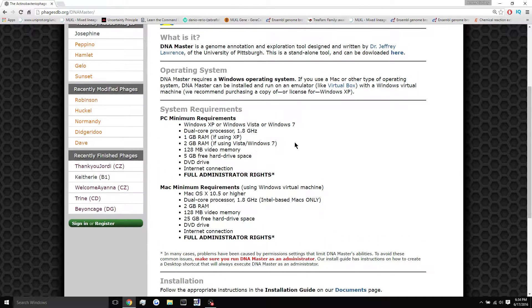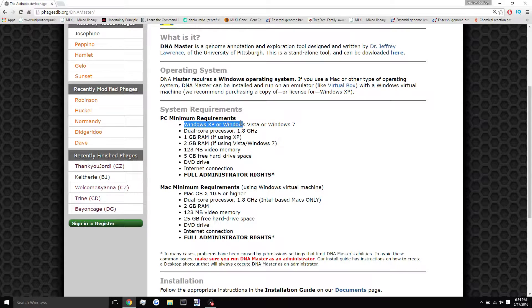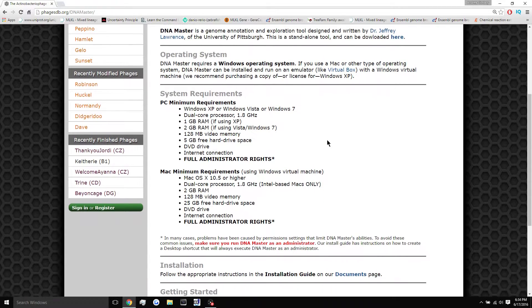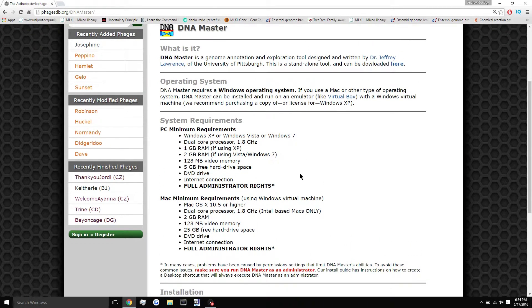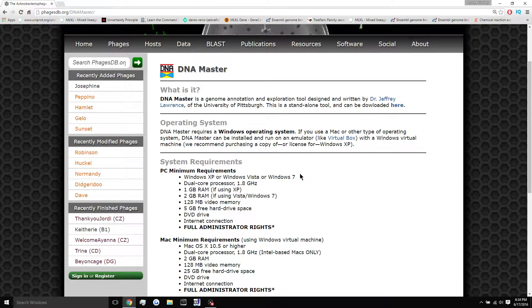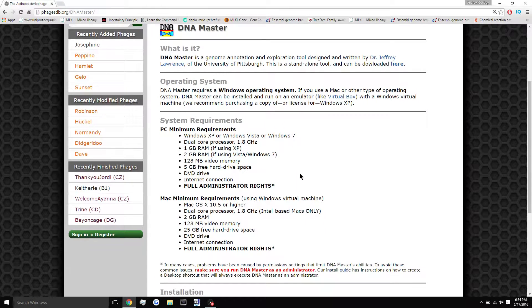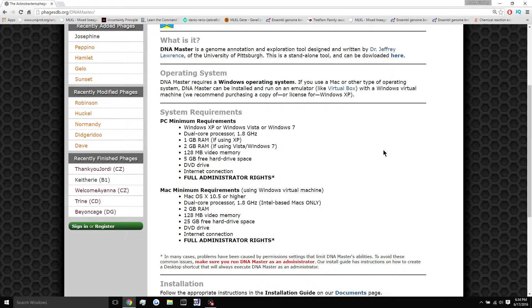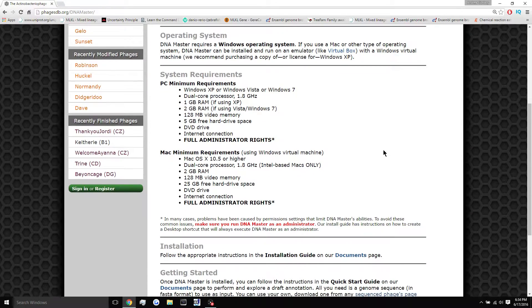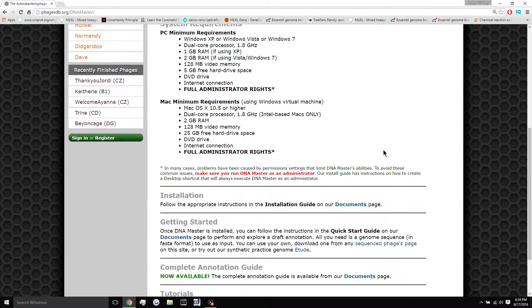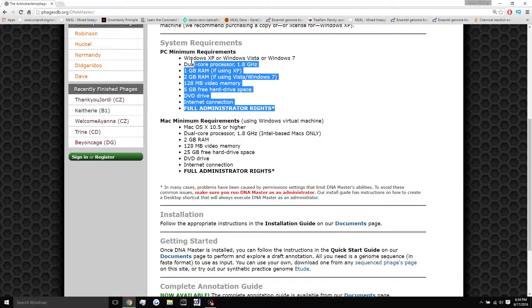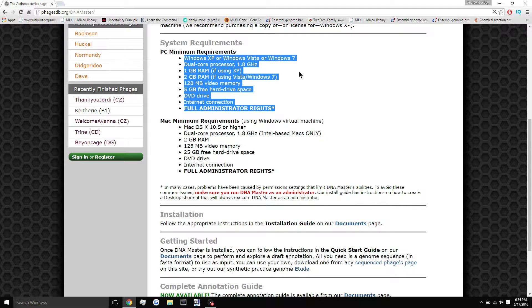So right away, I think all of your computers should be good to go. I mean, unless you're using a really old computer, the program itself is a little bit old. So the system requirements aren't that strenuous. So that should be no worry. Here they are, just in case you were wondering.